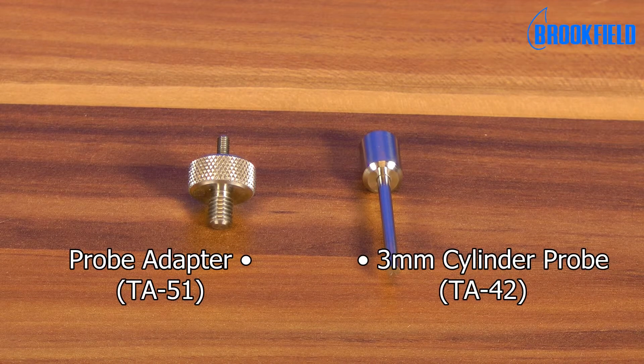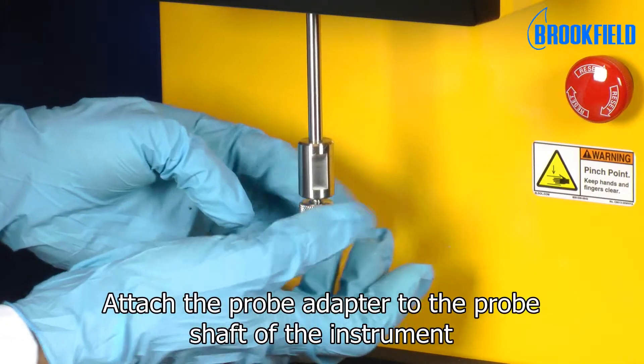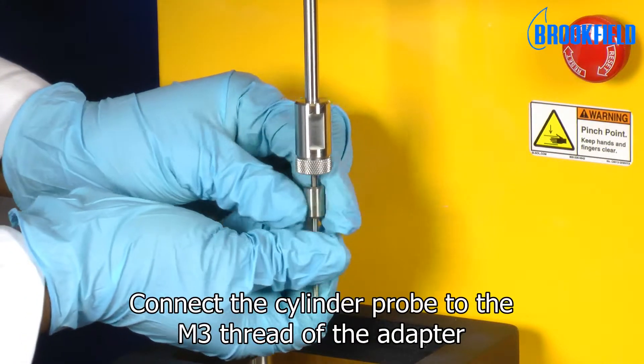Here you see the individual parts used in the test. Attach the probe adapter to the probe shaft of the instrument, then connect the cylinder probe to the M3 thread of the adapter.